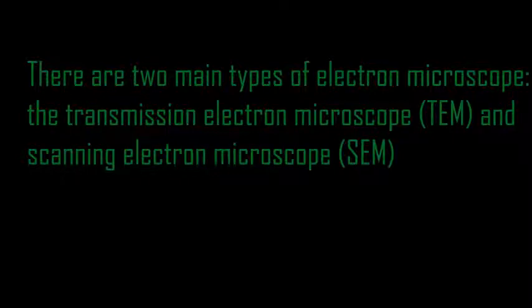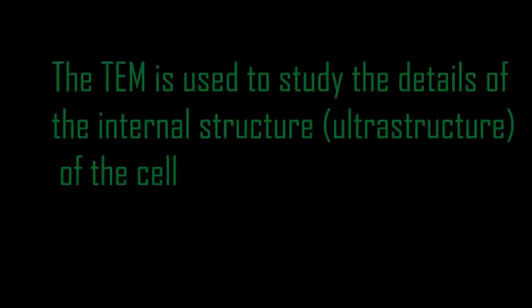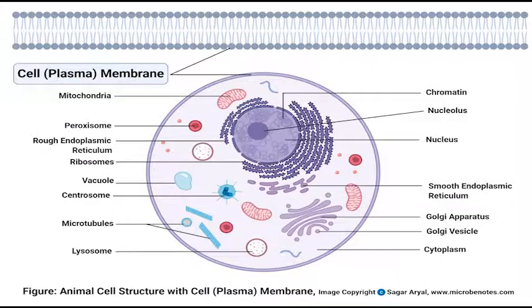TEM. The transmission electron microscope is used to study or to describe the internal structure of the cell. This means it illustrates the ultrastructure of the cell.